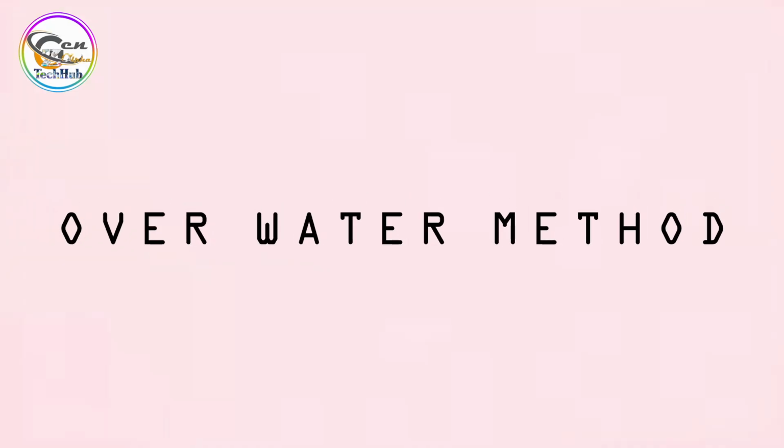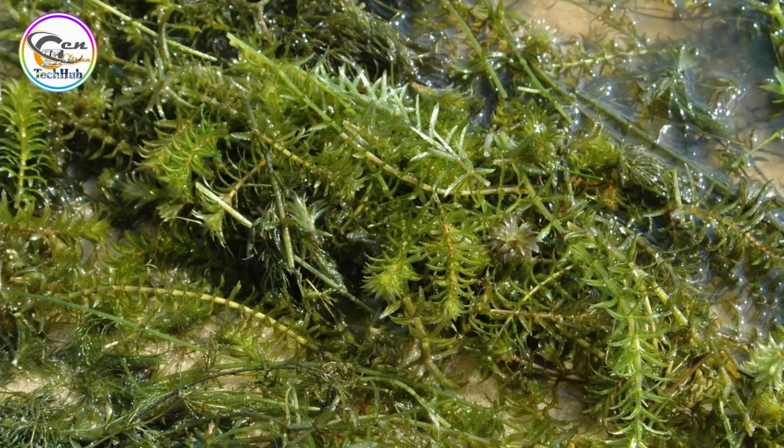When you are carrying out an experiment to show that it is oxygen gas that is produced in the photosynthetic process, definitely we should be able to collect that gas. And oxygen gas is collected by the over water method. So we are going to use a hydrilla plant, that is a plant that is adapted to photosynthesize under low light intensity.